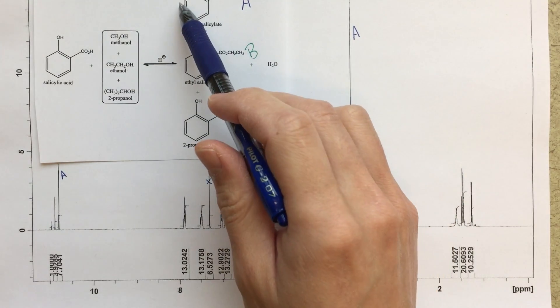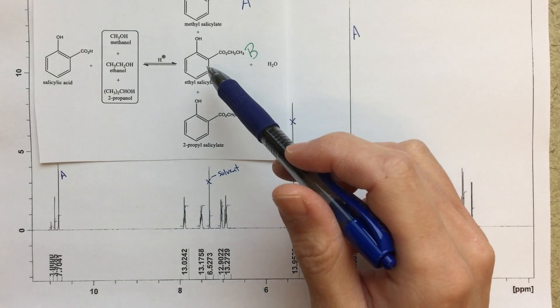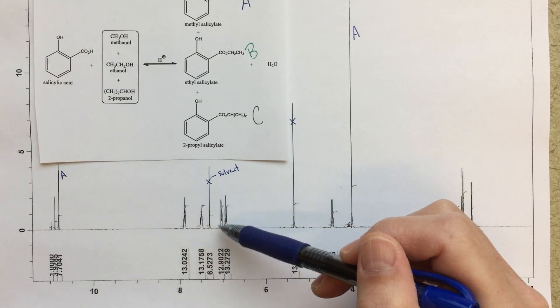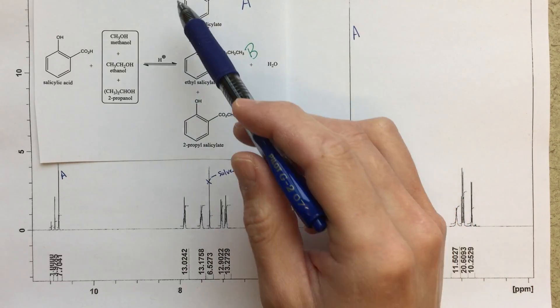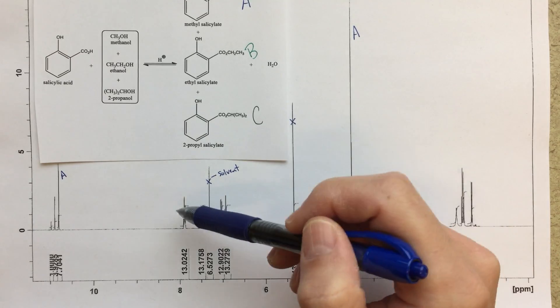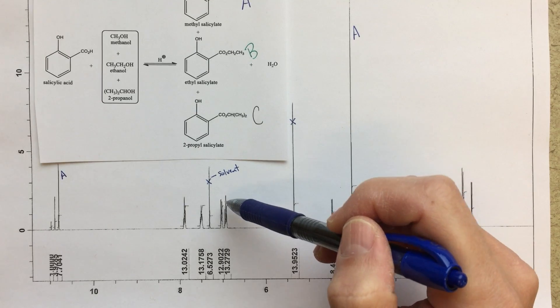In the aromatic region, each one of these should give four signals, four different signals in the aromatic region. And all of these are going to be mixed together. So all of these peaks that we're seeing in the aromatic region, I would expect all four of these to be mixed together.